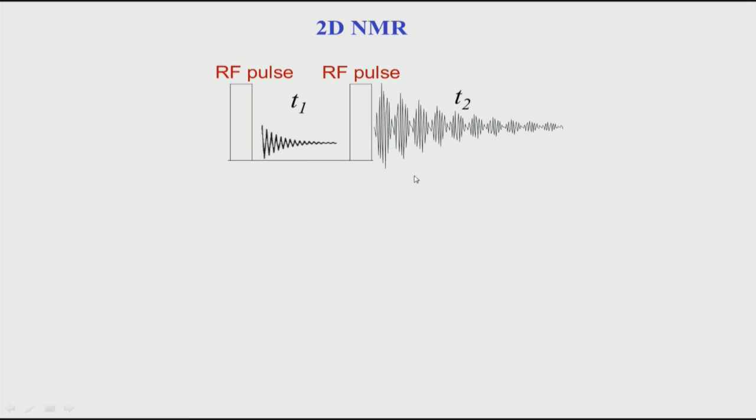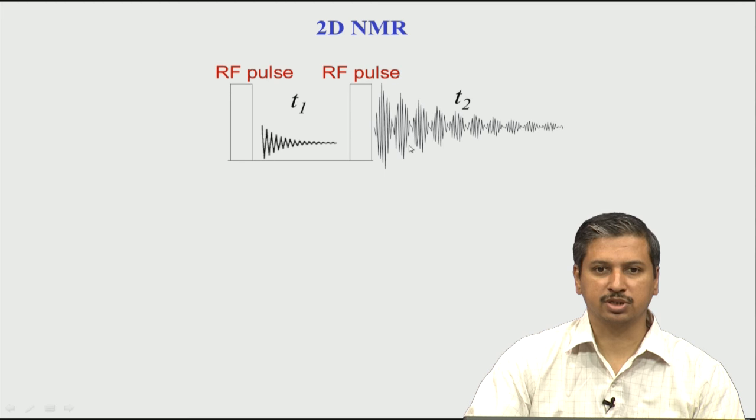Okay. So, this is similar to what we saw in the previous slide, but this is now coming more to the actual way we record NMR experiments in the spectrometer. So, we can call this spin A. Now let us see the mathematics of it. So, we have spin A, which is basically excited, let us say. In the first case we talked about generality, now we will go to a specific spin.